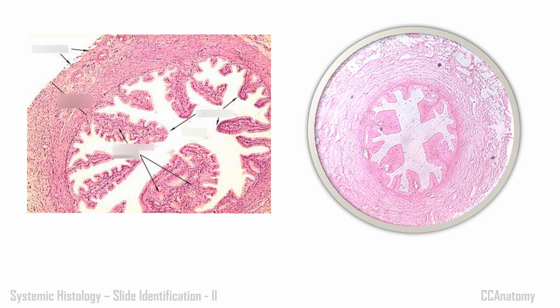Then this is one more structure with a proper lumen in it, and you can see the mucosa. The lumen is getting occupied with the folds which arise from the mucosa. If you closely observe, these are simple columnar epithelium. Here these are very tiny epithelium. In a bit higher power you can make out, but see the typical nature of the lumen.